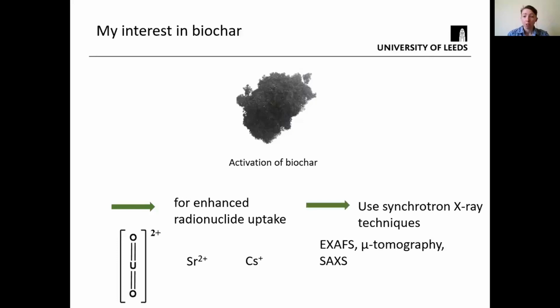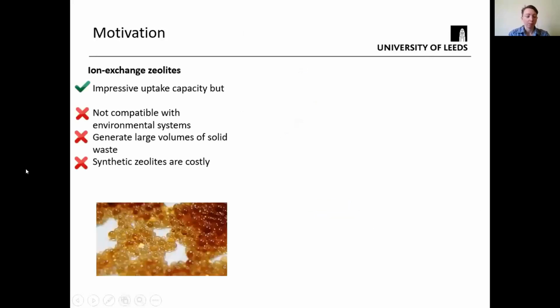I use synchrotron X-ray techniques in order to examine pore characteristics and architecture, as well as binding mechanisms and things like this. So in the radioactive waste industry, ion exchange zeolites are already quite well established, but there are a number of limitations they have.